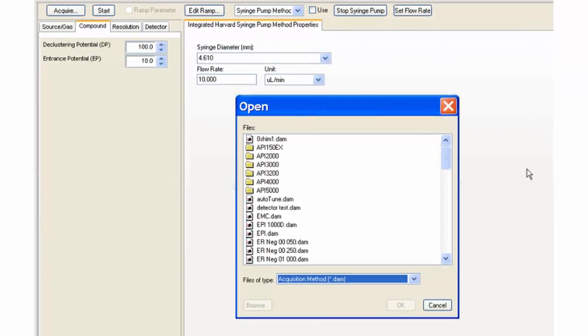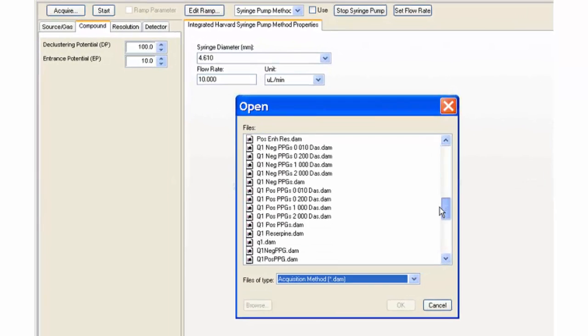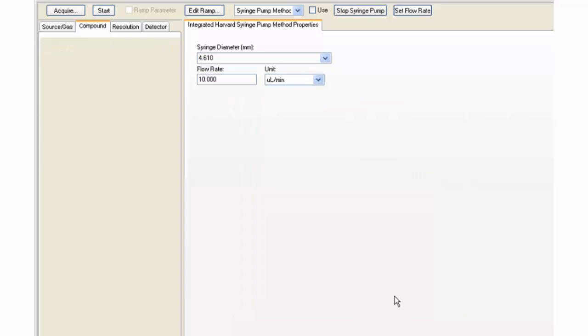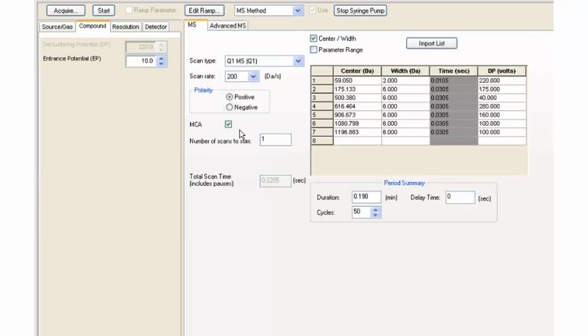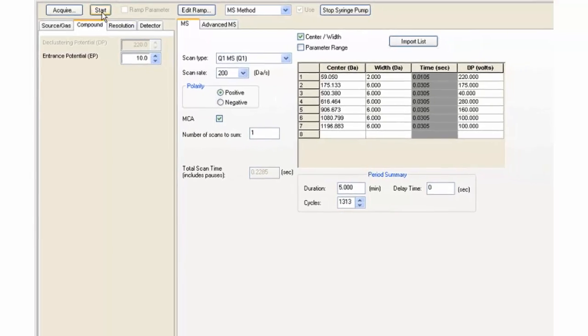Open one of the PPG positive calibration methods. Uncheck the MCA box and change the duration to 5 minutes. Click the Start button.